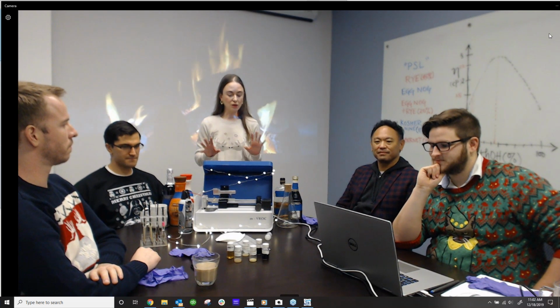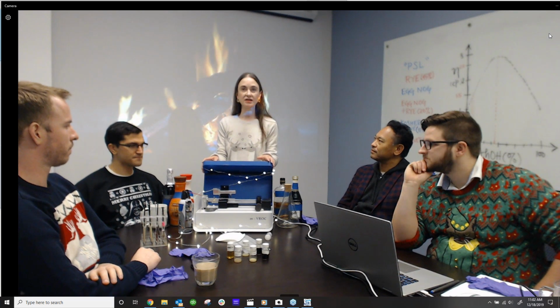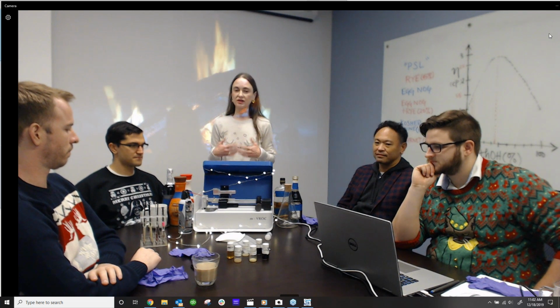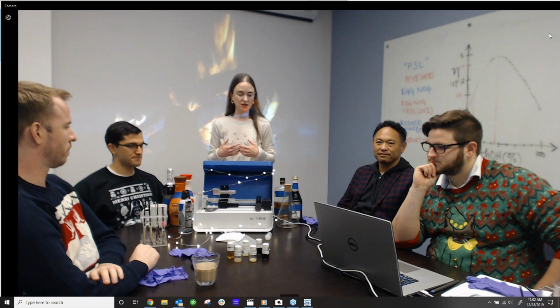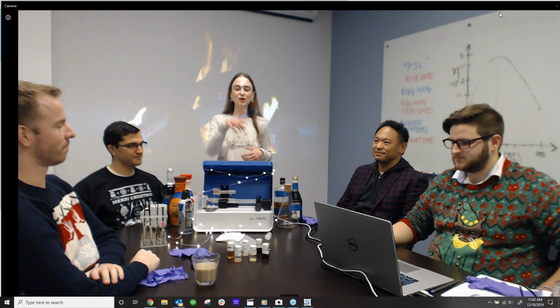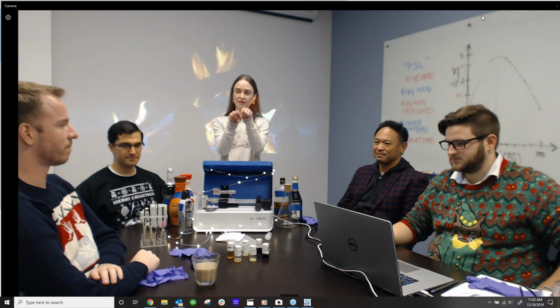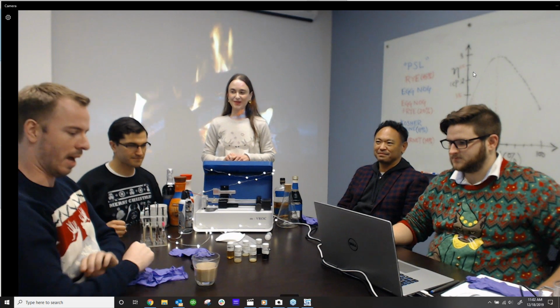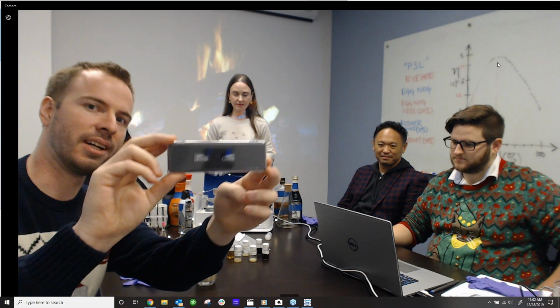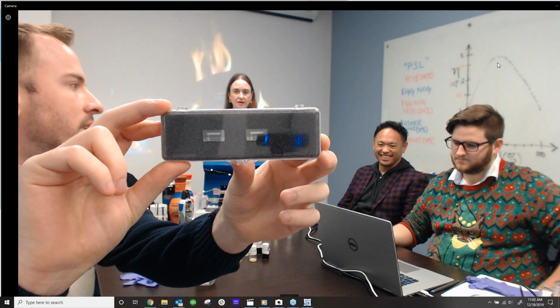So let's quickly, in case you're not familiar with our technology, we have VROC technology, so viscometer, rheometer, and a chip. This is a microfluidic viscometer, a bit different than your rotational system. I'm going to ask Nate, our service engineer, to show you the core technology of our system. So Nate, if you could show the chip to the camera. Absolutely. So here's a look at the flow channels of the chip. We made it pretty close here. So you can see this is what the flow channel looks like. Is that turning out okay, Brandon?